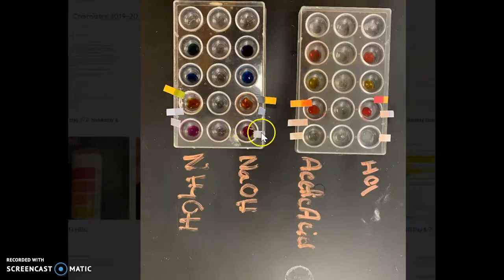Then for our bases, the red litmus paper turned blue, blue litmus paper stayed blue, and the pH paper for NaOH turned a deep blue color, indicating about an 11.0. Then our phenolphthalein turned a deep hot pink. The methyl orange was just a light orange, still kind of clear and see-through. Bromothymol blue was a deep blue, and it was a deep purple for the universal indicator, which is about a 10.0.